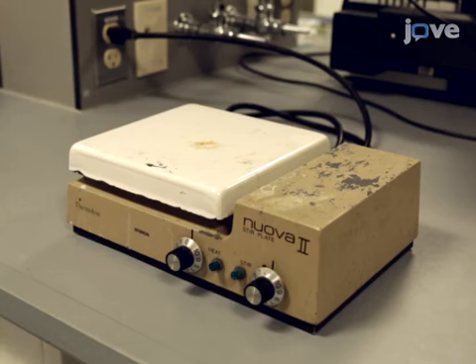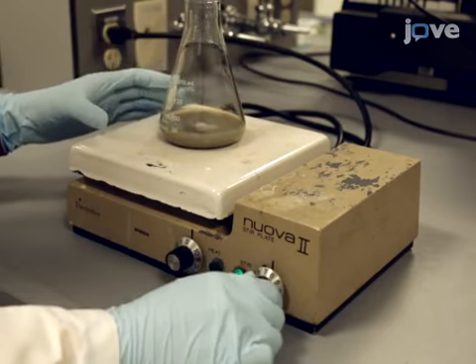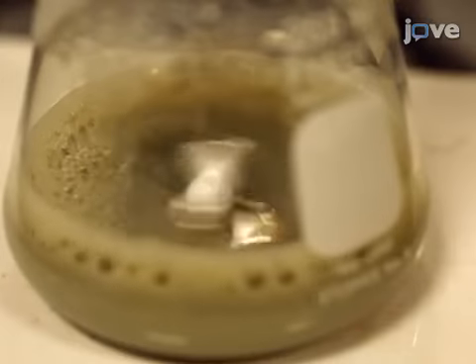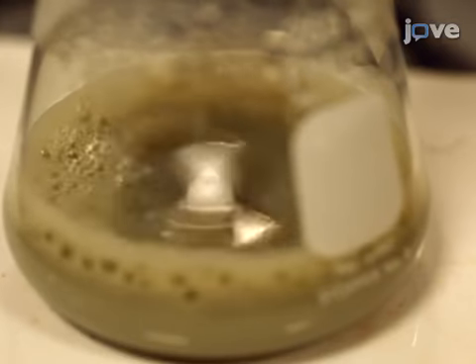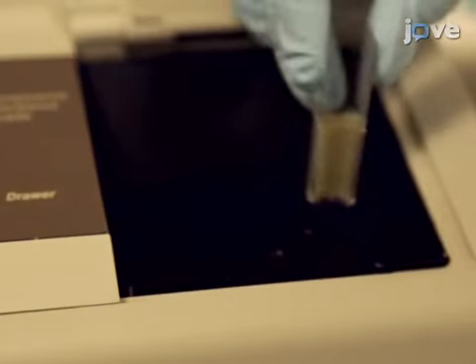After 25 minutes, put the flask on an unheated stir plate and let it stir overnight at 700 RPM. In the morning, the mixture should be at a stable state with a constant color and transparency. If desired, measure the absorbance of the nanoparticles.